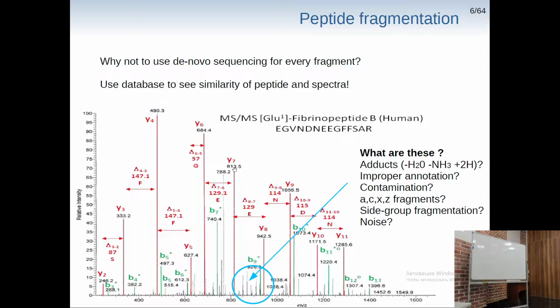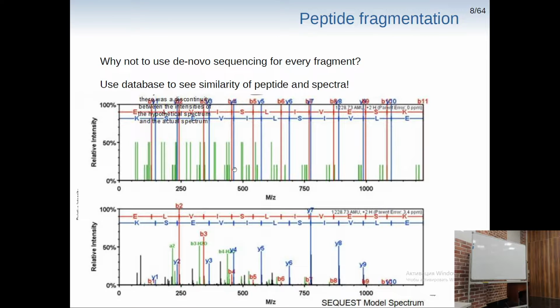So, we've decided that we can't de novo sequence every peptide, and also you have a lot of peptides. It's not always possible to construct the protein from them, because those peptides can be from different proteins, for instance, right? So that's another reason why we need a database. And also, a database allows us to search for those proteins and identify them more easily, with ease, without any problem. So, let us see how we will search our database.